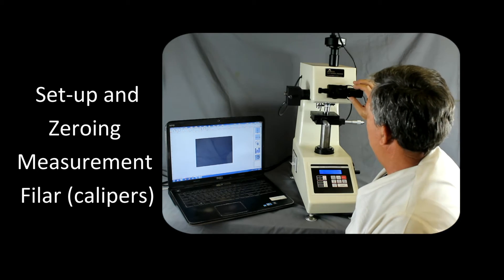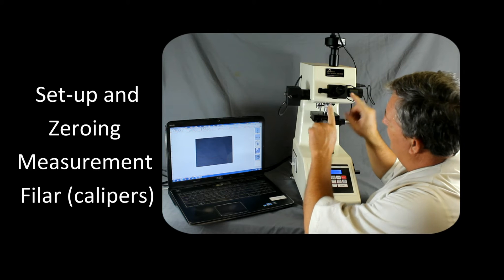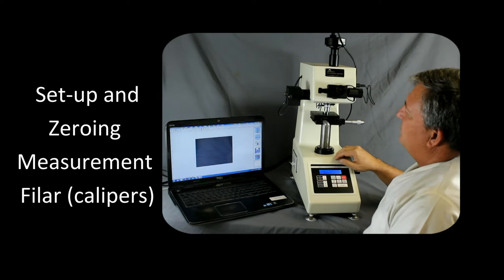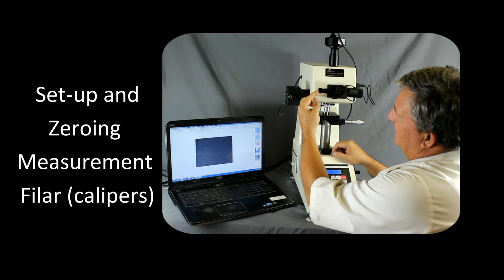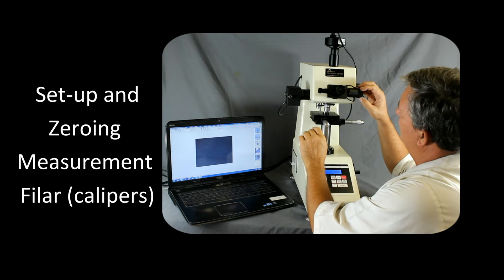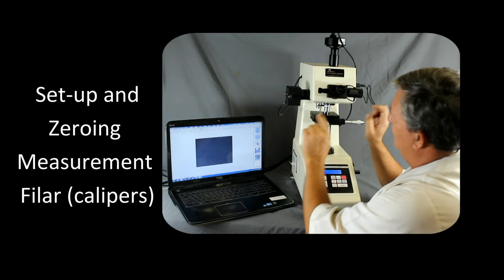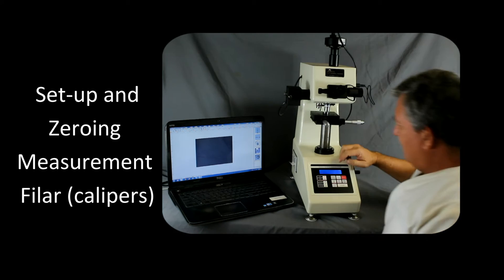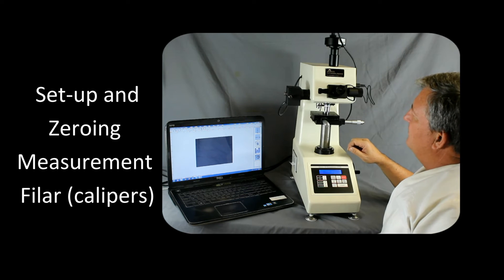Before we do anything, we want to come in here and adjust the focus of the eyepiece so that the filars on the inside are in focus. Once we do that, we want to bring the filars together so we can set them at zero. The left knob will move the filars left and right, and the larger knob will change the distance in between. We want to bring them so they're just barely touching, then hit the CLR button, and that will set our calibration for the filar.